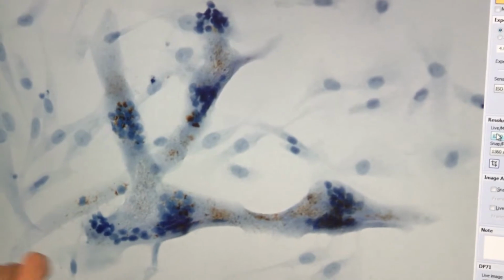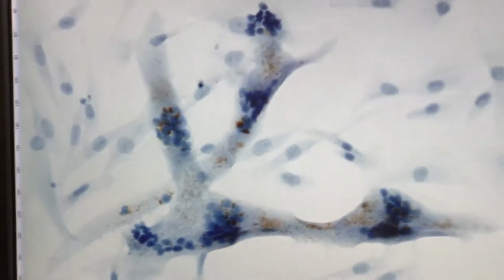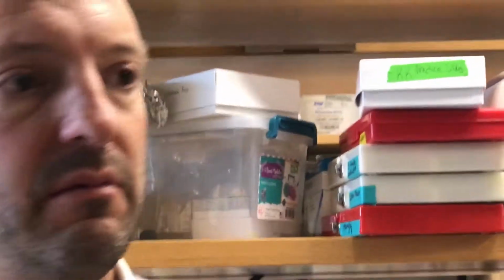You can see that in some of the nuclei if you zoom with the 100x objective, and in the cytoplasm. I can go even closer. Now, does this get to what I heard you say, the poly-A signaling that is protecting the DUX4 from degradation? Yeah, the poly-A signal is required to stabilize a messenger RNA. If a messenger RNA doesn't have a poly-A signal, it will degrade quickly. So for us to be able to detect these using this method, look at this.